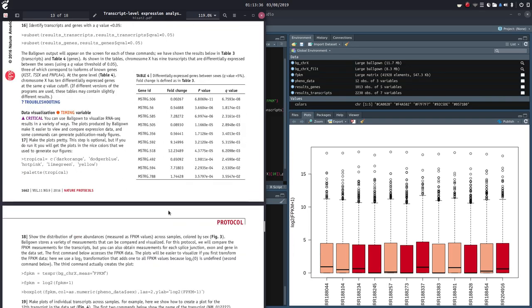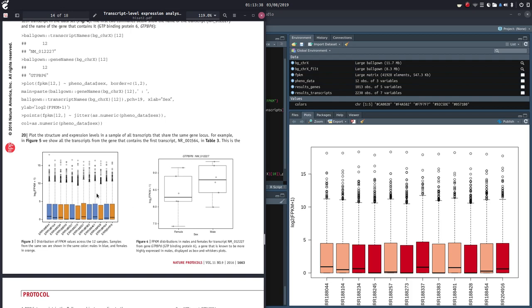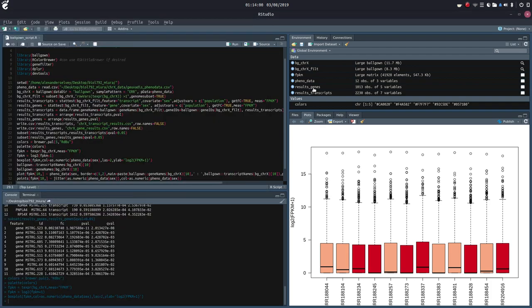Consistent with the protocol, our boxplot shows up quite nicely. Let me show you the boxplot — this is their boxplot, and our boxplot matches pretty much spot on. The salmon or peach color are males — here they have the males in blue — and our dark red are our females. So we made a plot.